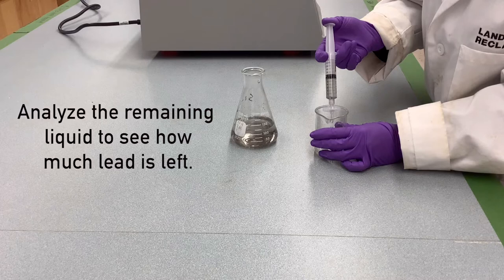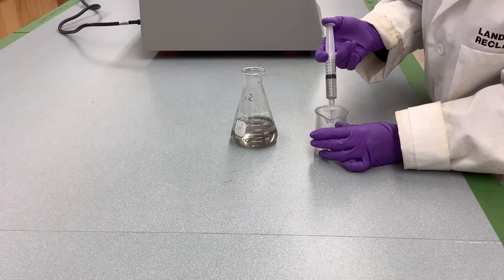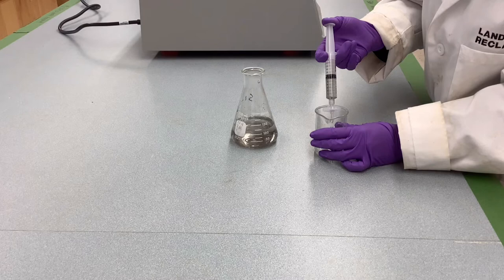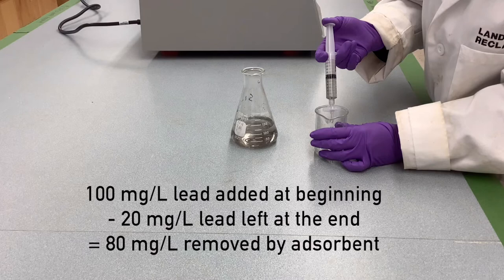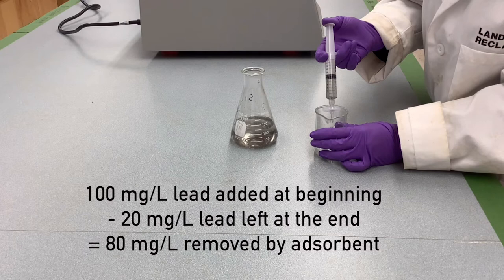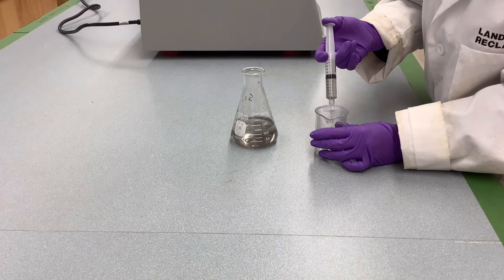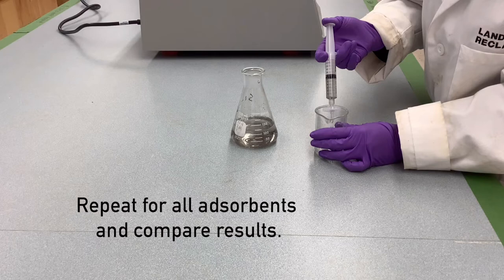Then we take the liquid that we filtered and we analyze how much lead is left in the sample in a commercial laboratory. This allows us to know how much lead the adsorbent removed. Essentially, if we know we put like 100 mg per liter lead at the beginning and there is like 20 left in the liquid at the end, then we know the adsorbent removed 80 mg per liter. We then repeat this with all of the adsorbents to see which removes the most lead.